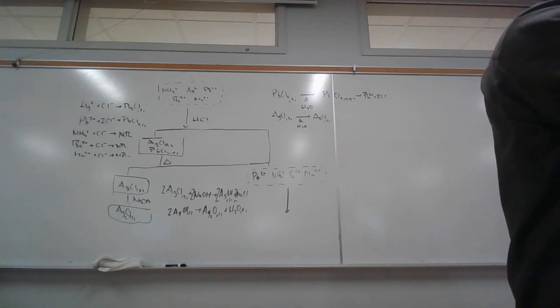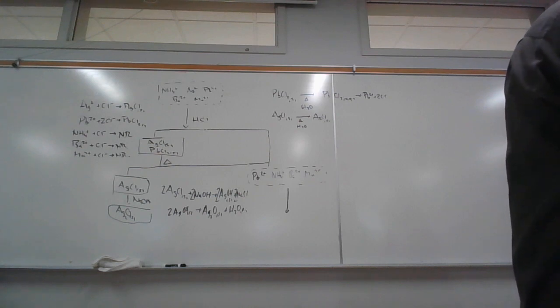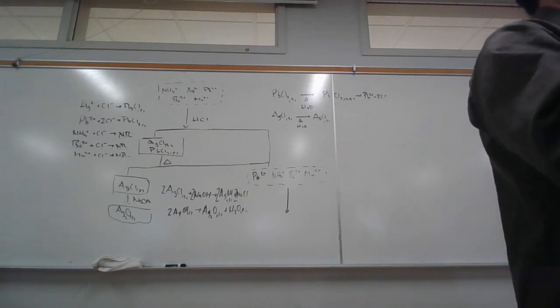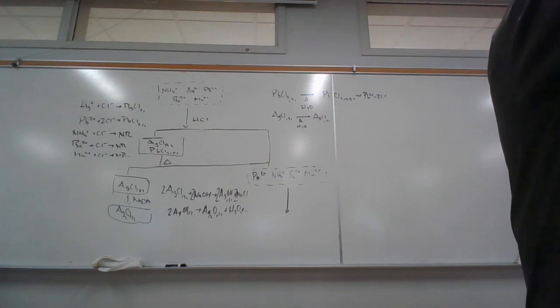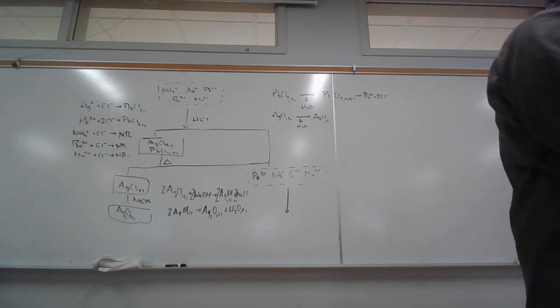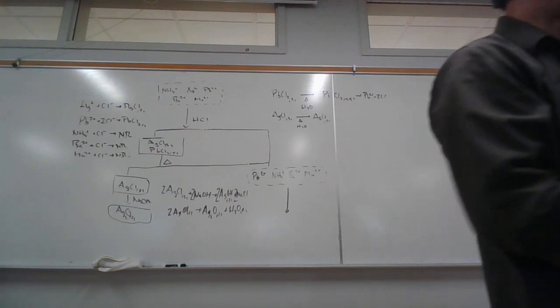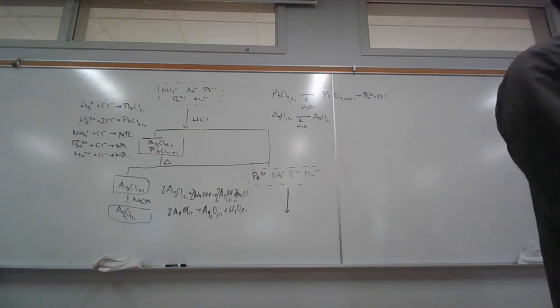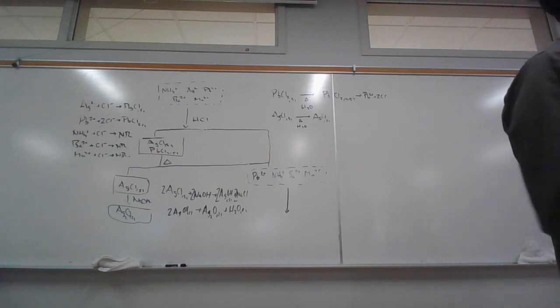Let me rotate this. Let's see if I have it lined up. And so normally when people pour liquids, they use a stir rod like this. I'll exaggerate. You use the stir rod to direct the stream of the liquid. And so something like this. All right, that last little bit in there, we usually wash out. That's your first wash. And so what's going to happen is there's going to be precipitate stuck on the inside of this and at the bottom. And so you use a little bit of the wash.